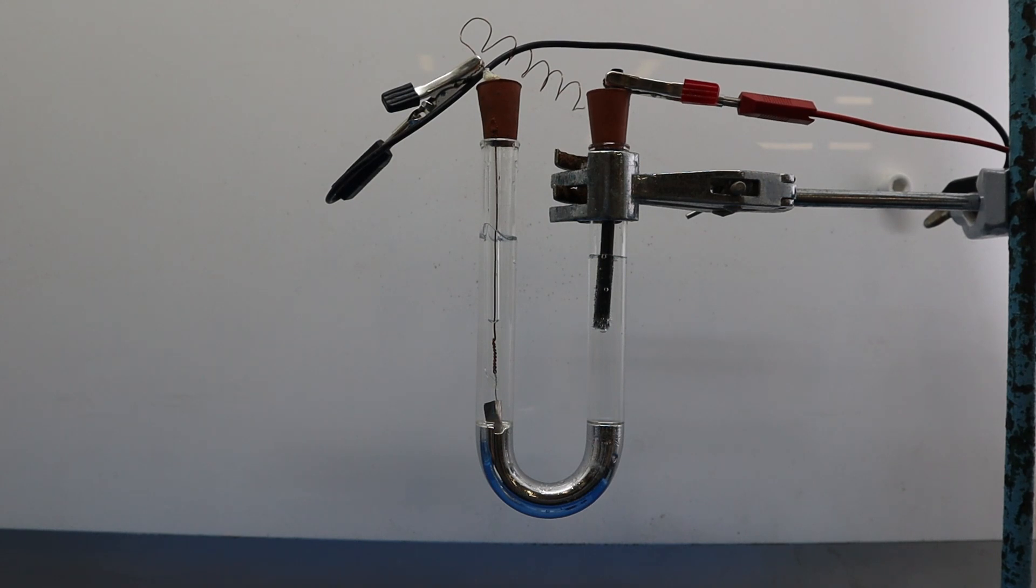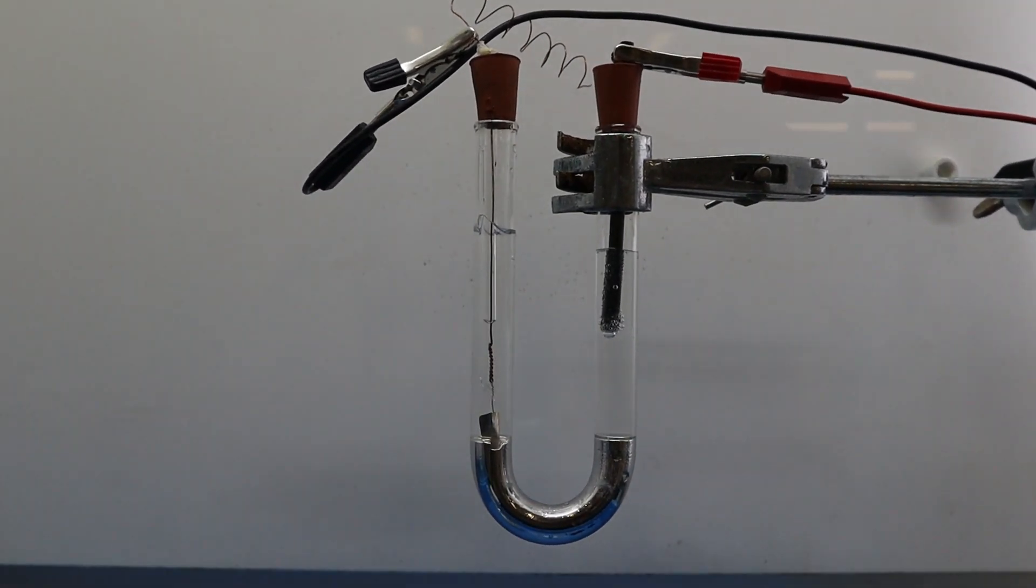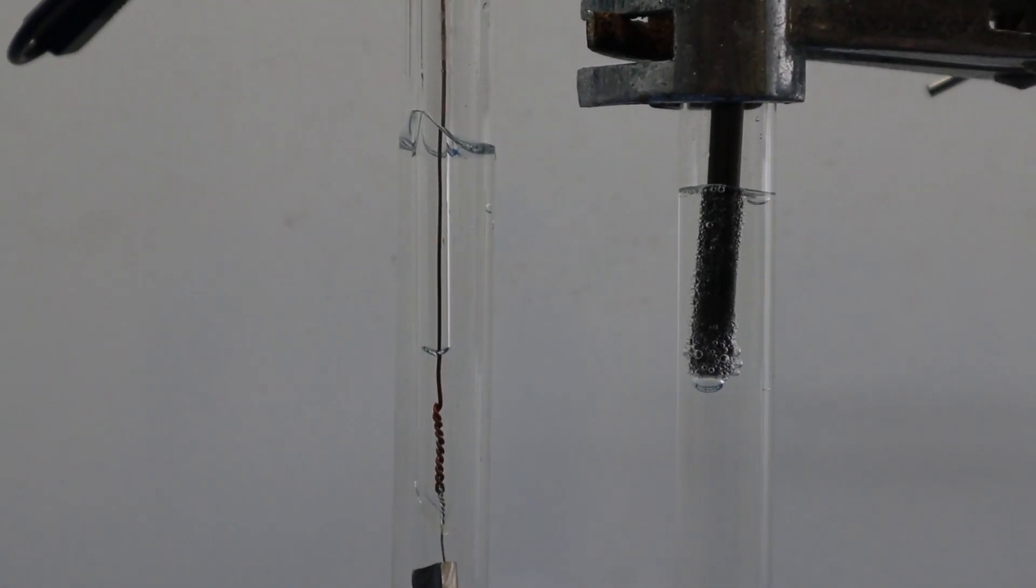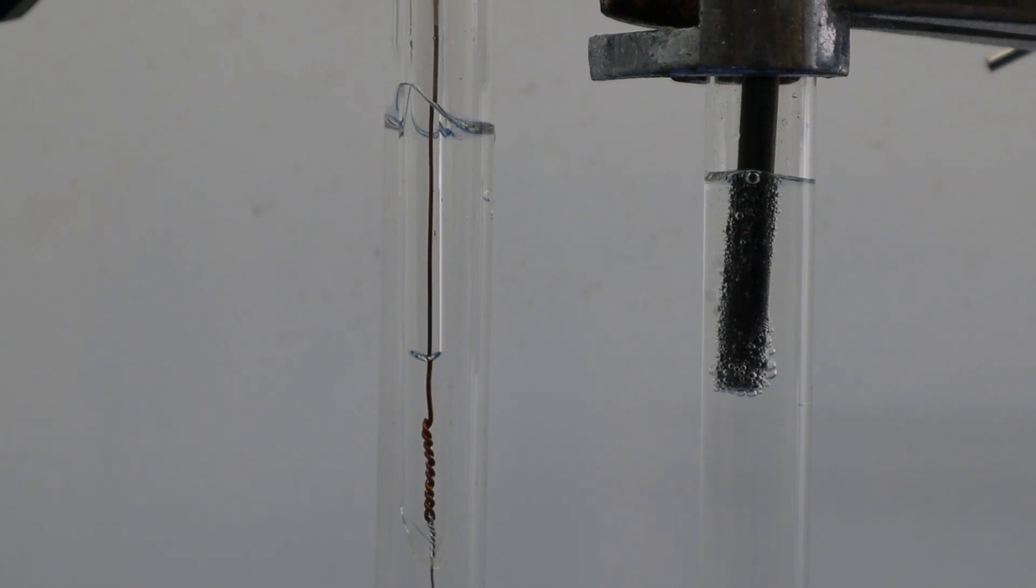Now the power pack is turned on. Now you can see clearly, gas bubbles are formed on the surface of graphite electrode. It is expected to be chlorine gas.